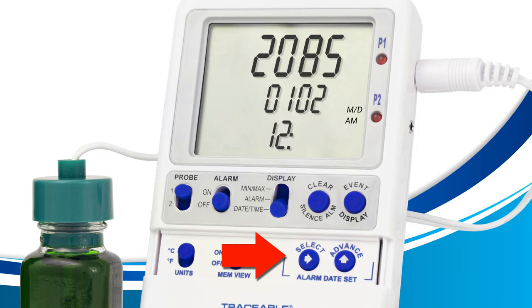Press Select again, and now the flashing will be in the time format area. Then, pressing Select one last time will have no fields selected. As you can see by this lesson, the Select button allows you to select fields on your screen.